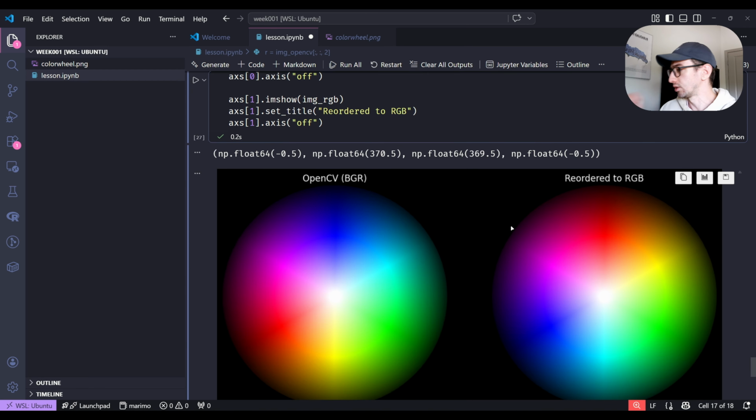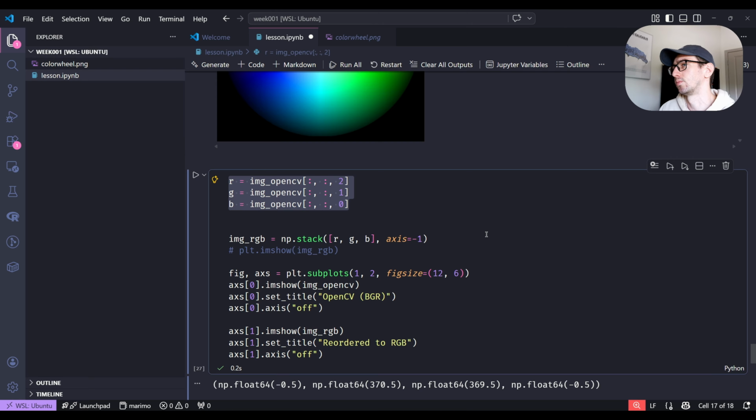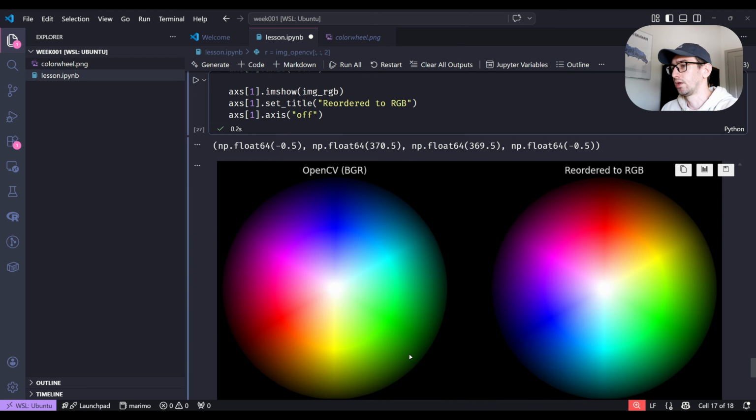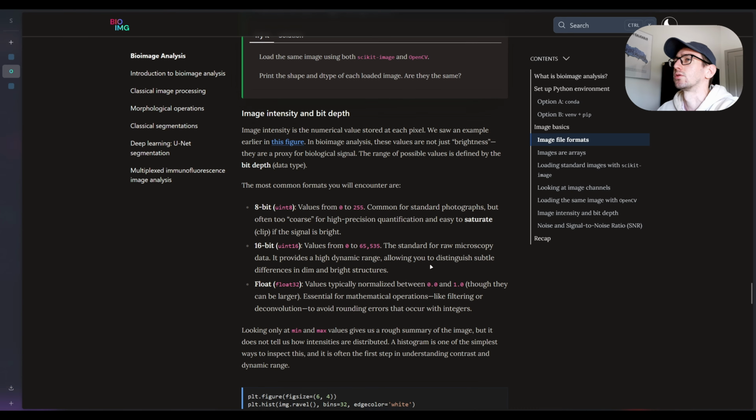As you can see, Dastan sent another way, which basically does the same thing: it splits the image using the split function, and then we use merge from OpenCV. But in my case, I usually try to use NumPy because it's easier for me. I need to know just some methods from the NumPy array, and then I can just apply them.